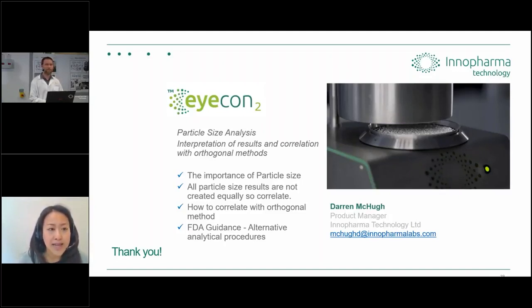A question that came in is, any way of measuring the specific surface area of large granules with this equipment? Yeah, good question. Unfortunately, short answer is no, as the current technology stands. It is designed for particle size and shape, but technically, it could be possible with further development. It's not something we're specifically, let's say, selling this instrument toward, but I'm just speaking because it uses a crossover of light.